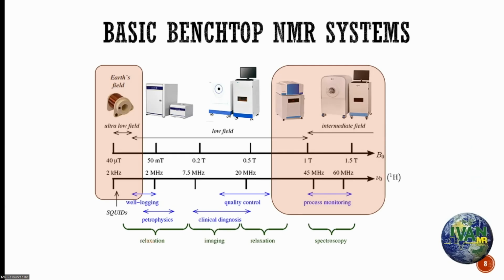But with advances in technology, in particular magnetic technology, we were able to push the magnetic field higher to a range where it allows spectroscopy. So what we're focusing on in today's talk will be magnetic field strength between 1 Tesla and around 1.5 Tesla for a permanent magnet system in this case. And with this magnet configuration, we can now do some really cool Fourier transform NMR spectroscopy as a result.